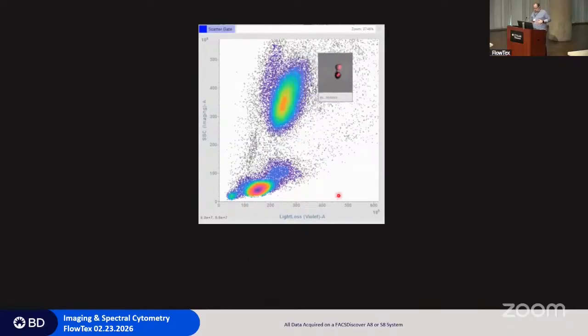It's going really fast. Anyway, I usually don't go this fast. I think it's playing at like 1.5 speed, maybe two times speed. But the idea being, you have the ability to control what the image is. If you want to look at bright field image or your fluorescence or scatter image, you can control that.